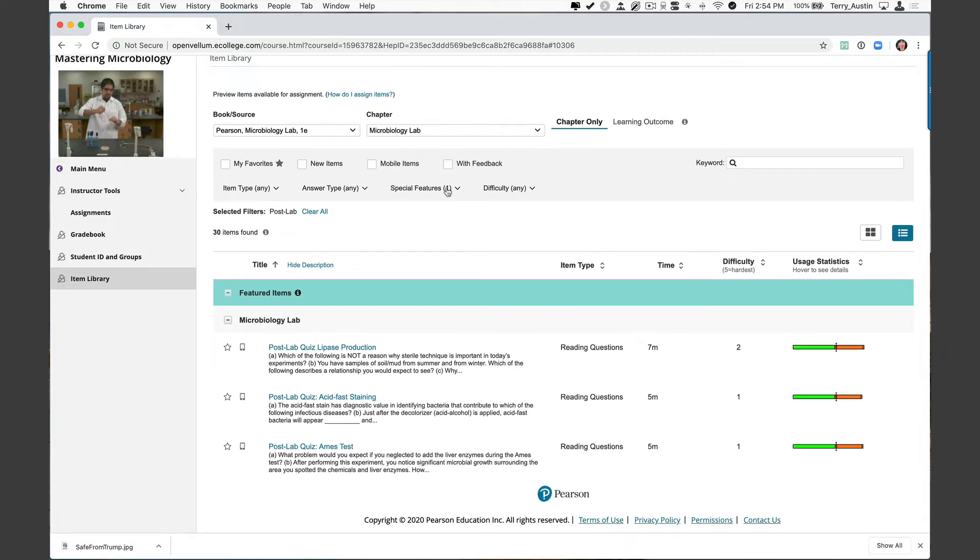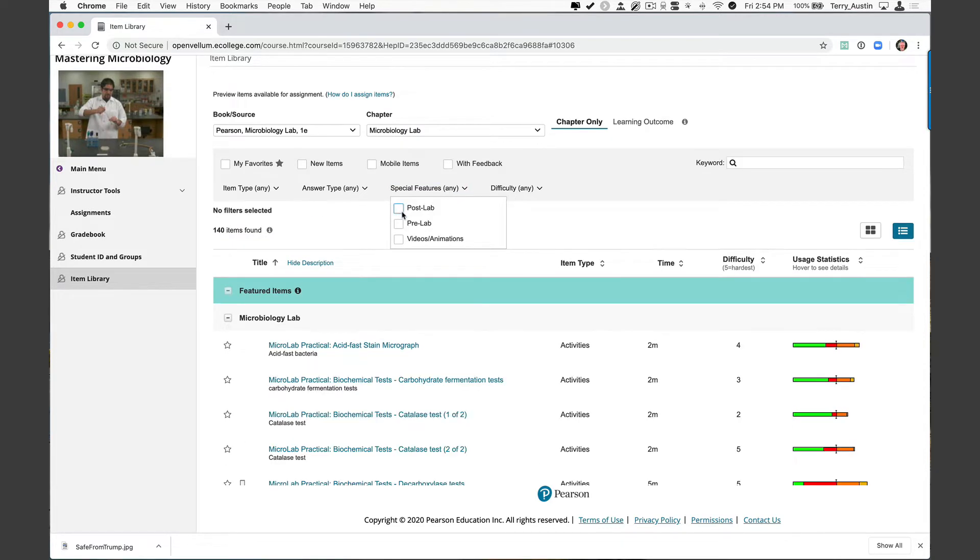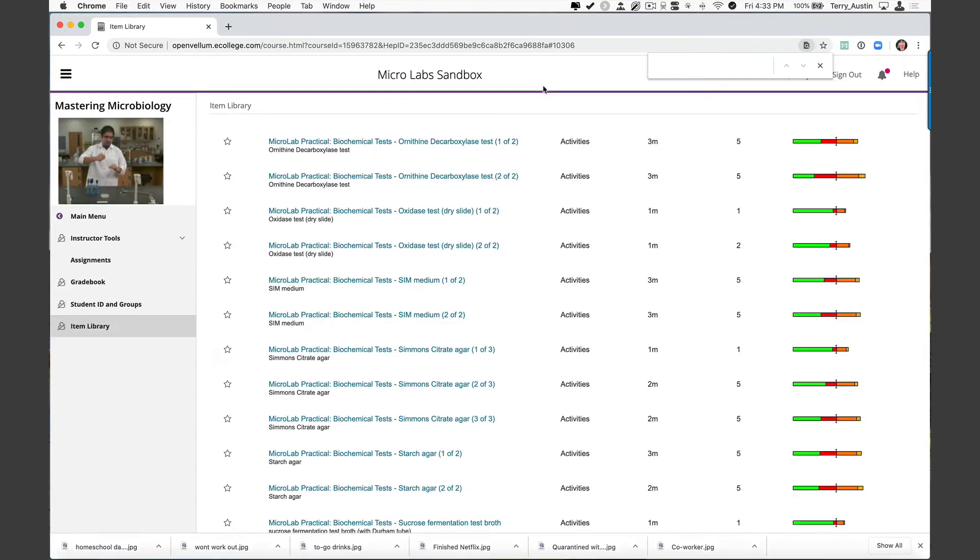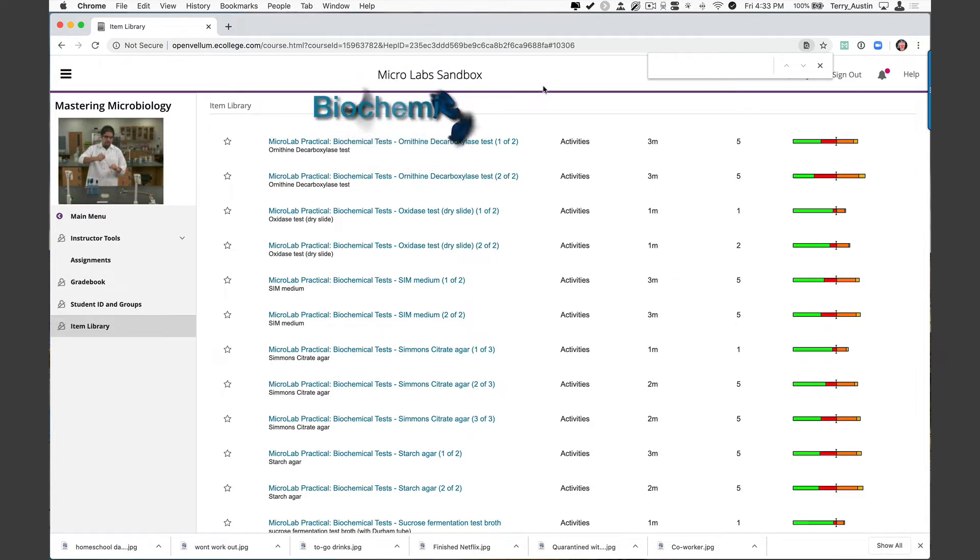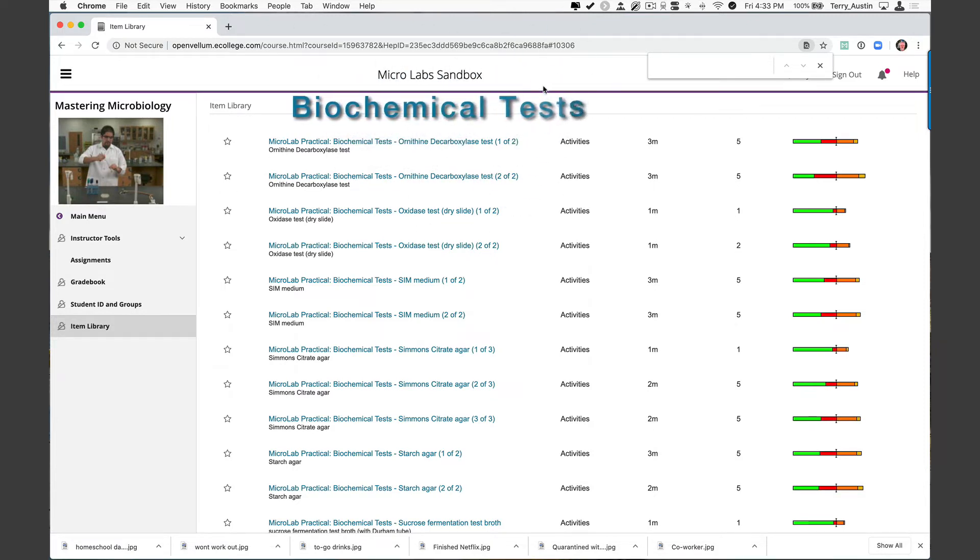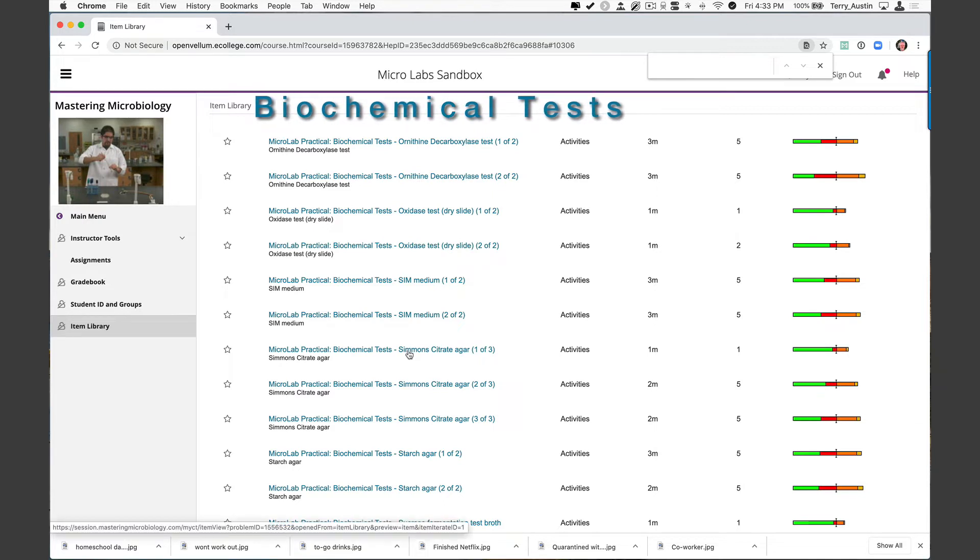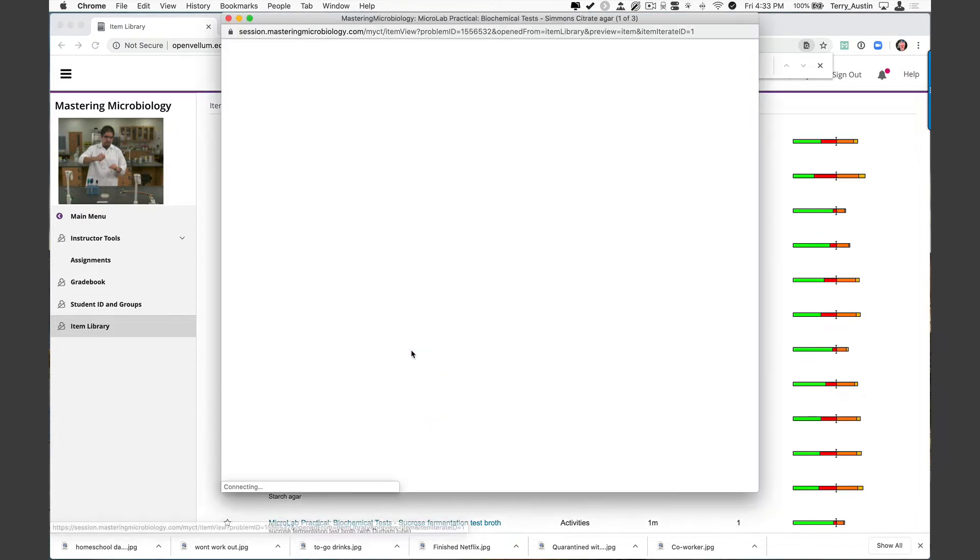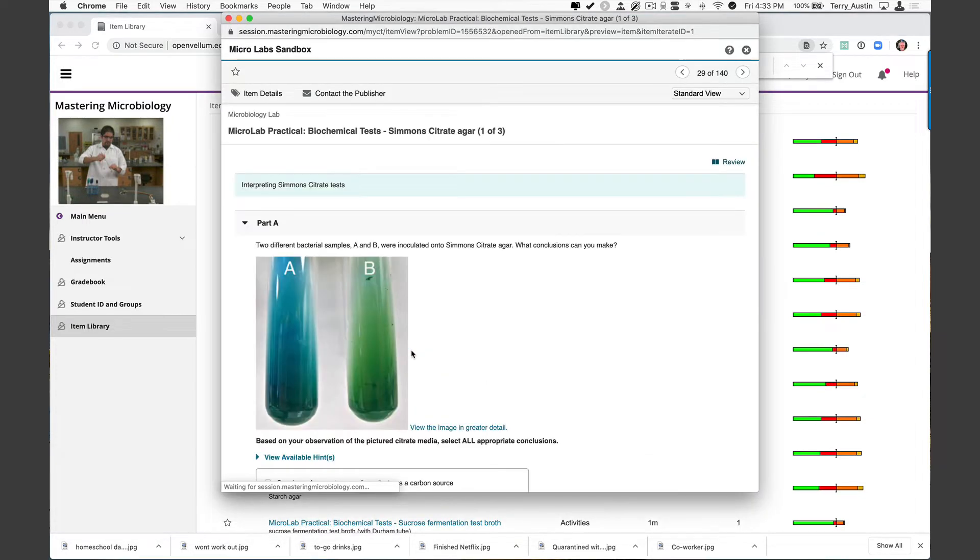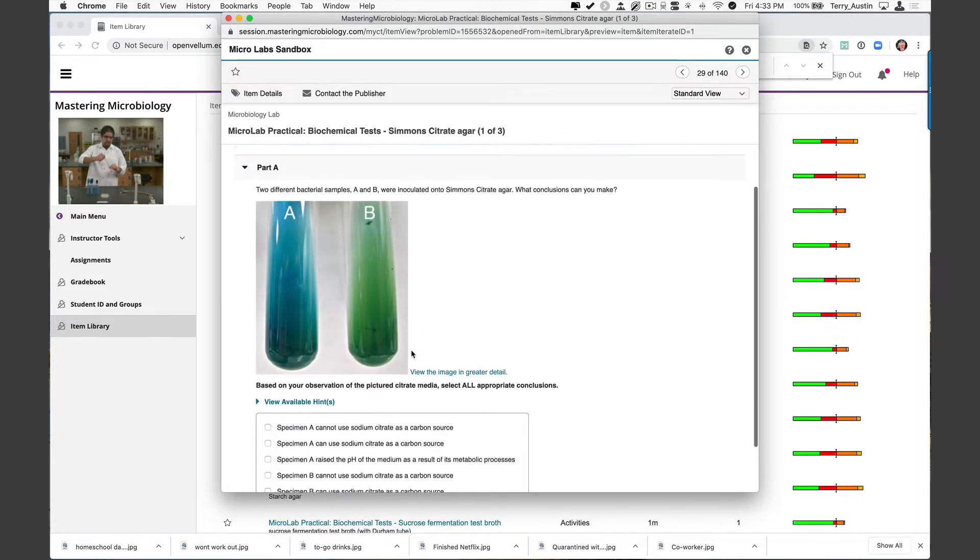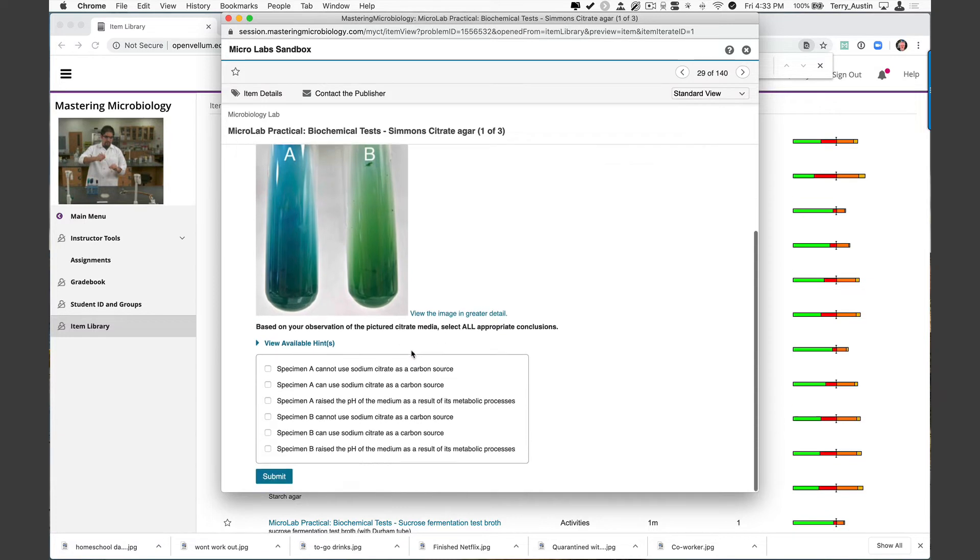Let's go back and clear some of these filters and begin to take a look at some of these items now. Let's start with a real workhorse of most of our microbiology labs: biochemical tests. We have a lot of these here as assignables. Simmons citrate is one of my favorites. We'll look at one of three questions that are assignable. This one actually has a pair of different results: specimen A and specimen B.